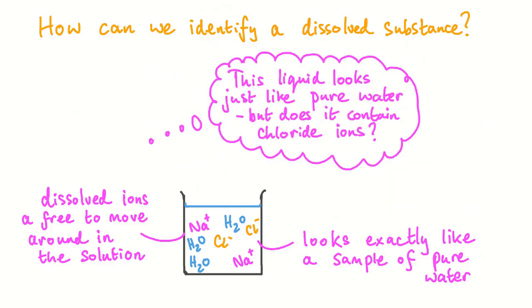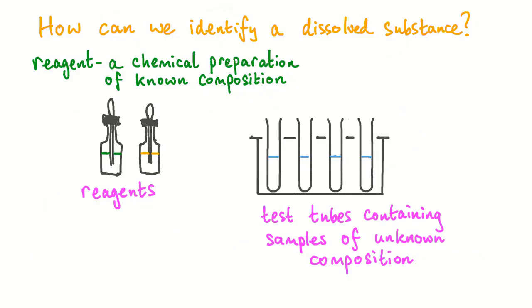In the laboratory, it may be very important to know if these ions are present. We must assume that all unknown substances in the lab are toxic or poisonous, so we must never taste unknown samples. We need some simple chemical tests to answer questions such as, are there chloride ions in this solution? Fortunately, there are a range of reliable tests that can easily be performed in a lab with some test tubes and some known test chemicals or reagents. These tests are quick and give an obvious result.